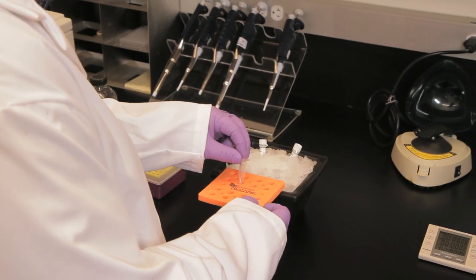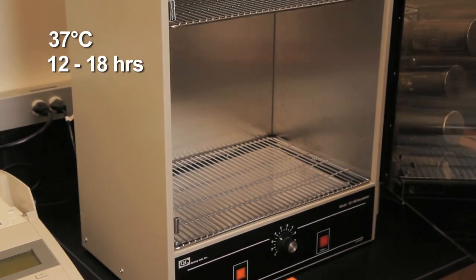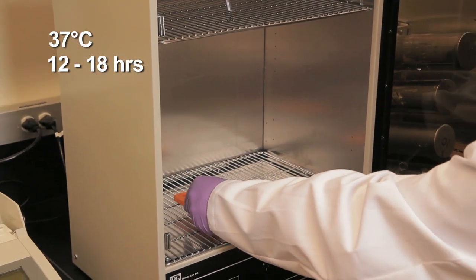Incubate both tubes at 37 degrees Celsius for 12 to 18 hours, during which time the BGT will add glucose to the hydroxyl group of 5-hydroxymethylcytosine groups in the sample.